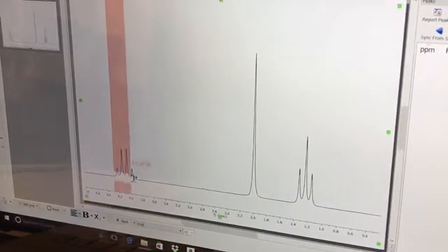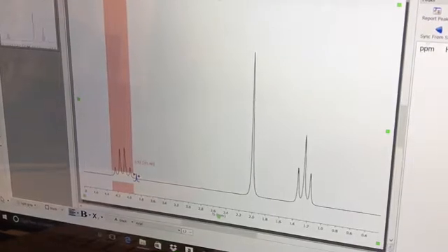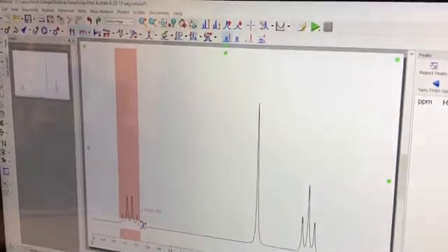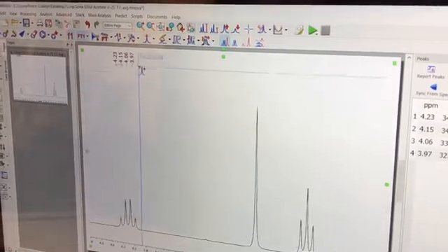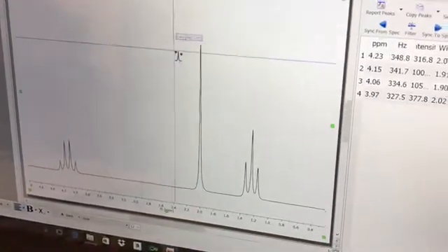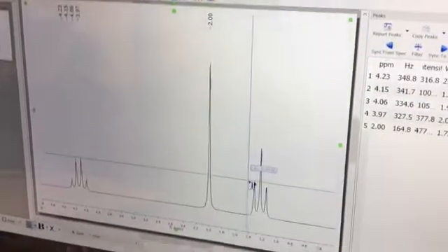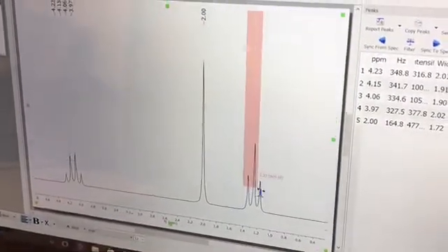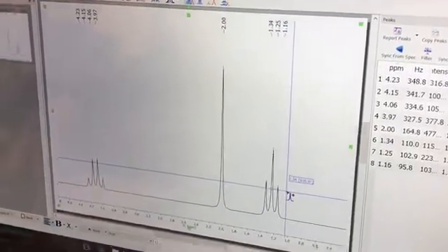Select, and drag across to the right of your rightmost peak so that all of the tops of your peaks should be within the red box. When you release, you'll see your peaks have been labeled up here at the top. You'll do this for all of your peaks, and then you can push ESC to exit this mode.